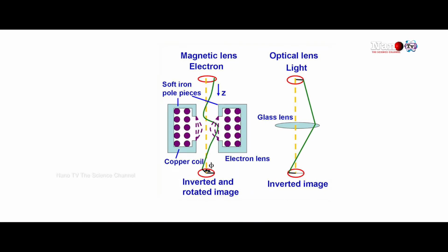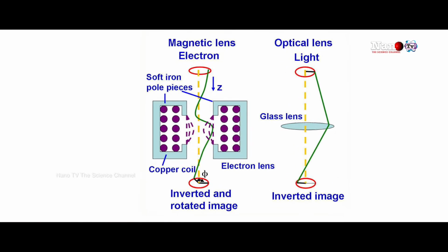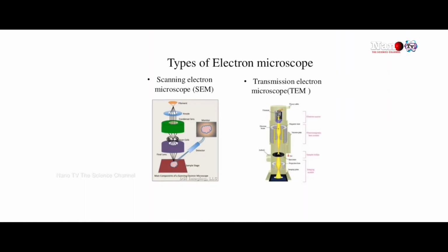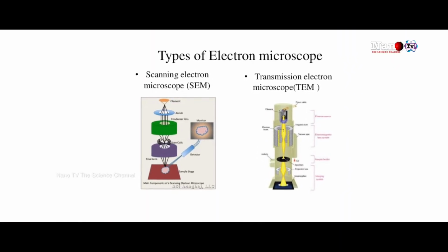In the scanning electron microscope and the transmission electron microscope, there are lenses, similar to an optical microscope, but the lenses are electromagnetic and electrostatic. Depending upon the structure and type of reflection we want, the type of divergence, the type of convergence, all those things are done using electron optics, and this will be discussed in this series. To understand this, we must know the structure right from the beginning, the top of the microscope.